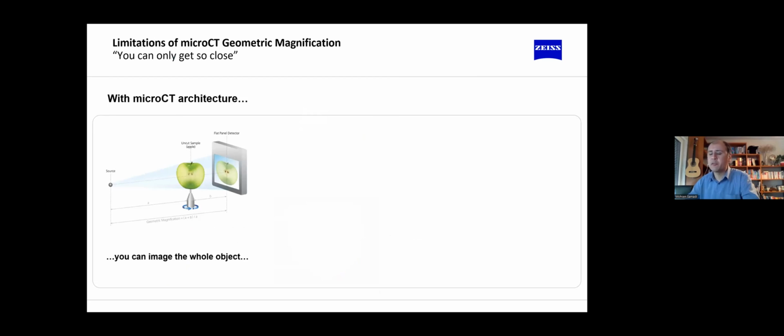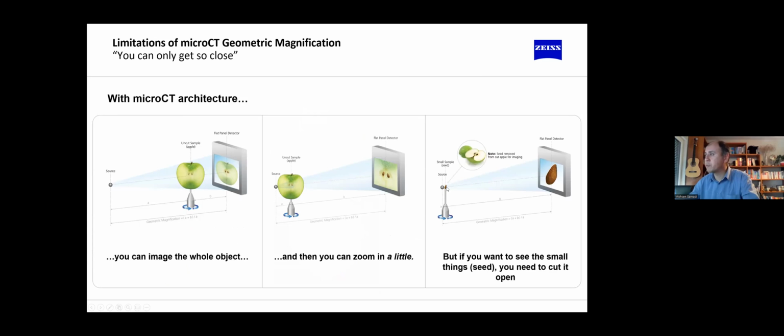So what is the limitation of micro CT? When larger samples are to be investigated: for a higher resolution, one should take the sample as close as possible to the source, which is the case here. But the limitation of geomag becomes clear here. For example, if the region of interest lies in the center of the sample, then it's not possible to get closer to the source to have the maximum geometrical magnification, and that's why the sample should be sacrificed to the region of interest. That is how high resolution is achieved in geomag-based systems.